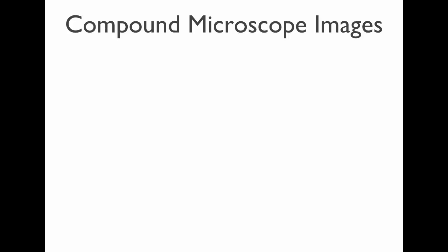So you don't have these next few slides. These are just showing you some examples. So in the compound microscope, what we see looks really flat.